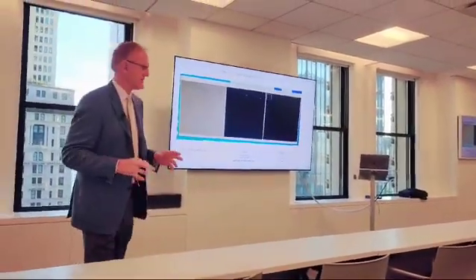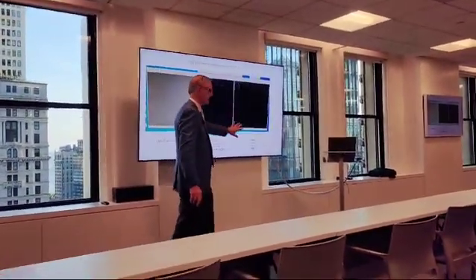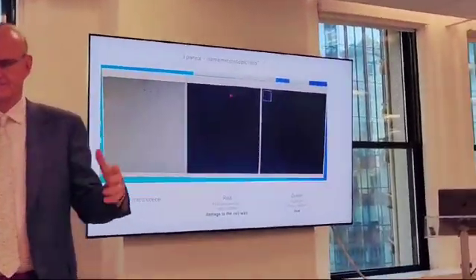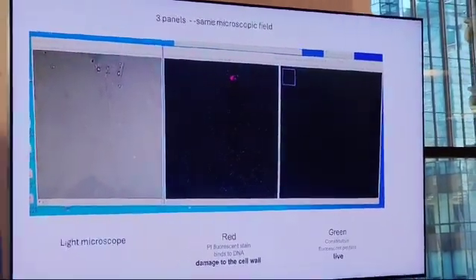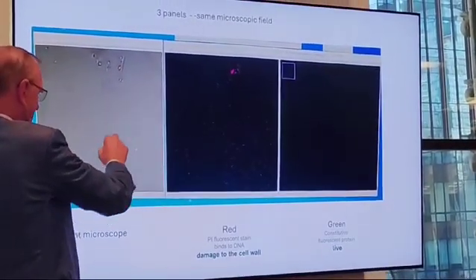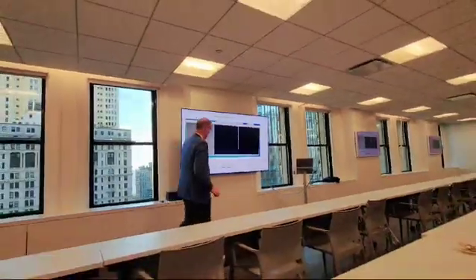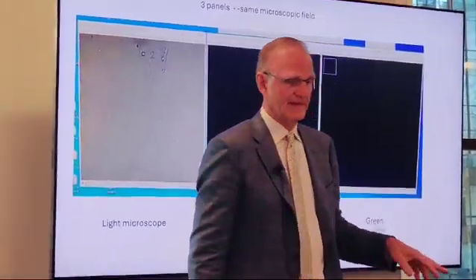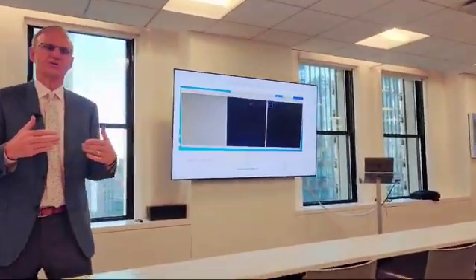Kind of fields. One is a dark field microscopy that's red, one's a green field, and this is the light microscopic level. This is at magnification. Now under light microscopy, you can't really see the bacteria, so you're just going to see a little tiny black dot in that view. And in the mouth, the bacteria have the ability to have fluorescence, and it's shown as green.